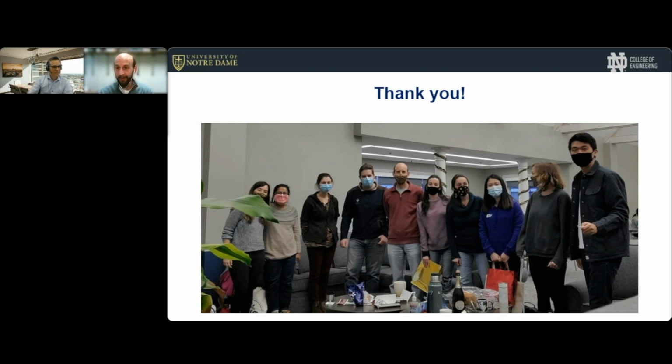The mechanical properties one, both the phase field model and the mapping, those have both been published recently in Biotechnology and Bioengineering. I think the references are in some of the slides. But again, if not, I'd be happy to share them with you, and those methods are described there as well. I think some of the same tools that we use to determine roughness, areal enlargement, porosity can be applied to the OCT as well. You have to just be careful with thresholding and things like that. But yeah, it boils down to image processing like we would use with other tools as well.